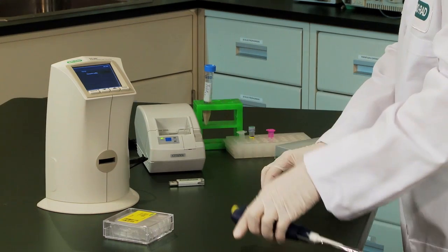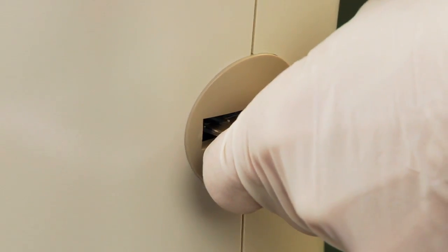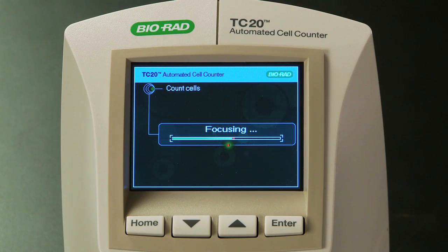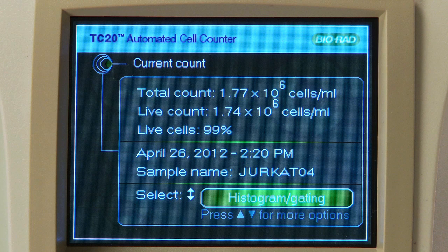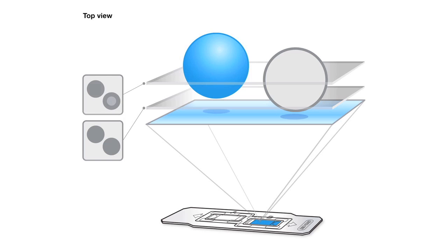The TC20 cell counter also gives you the flexibility of using Trypan Blue only when you want cell viability information. The TC20 automatically detects the slide and checks whether the sample contains Trypan Blue. The autofocus then identifies the best focal plane to discriminate cells from background. If Trypan Blue is detected in the sample, the TC20 counter uses multi-focal plane analysis in which each cell is scored on multiple focal planes to determine if it is live. This prevents undercounting of live cells that can happen when a single focal plane is used for analysis.